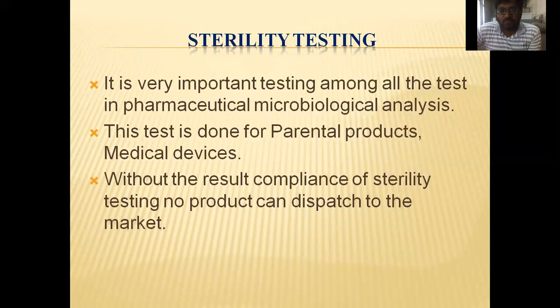This is why sterility testing is important, because without compliant results of the sterility testing, no product can be dispatched to the market. You have to submit the documents of the sterility testing for compliance, and only then will that product be dispatched into the market.